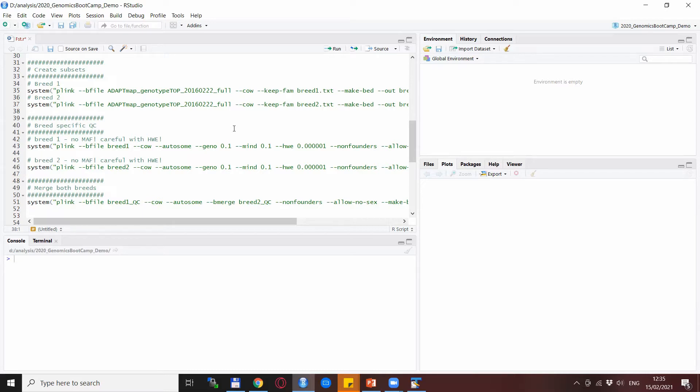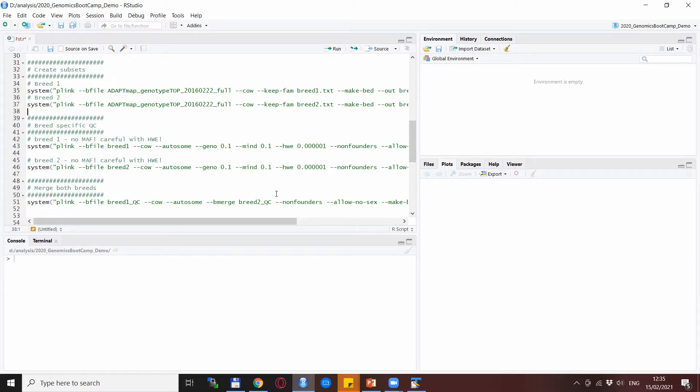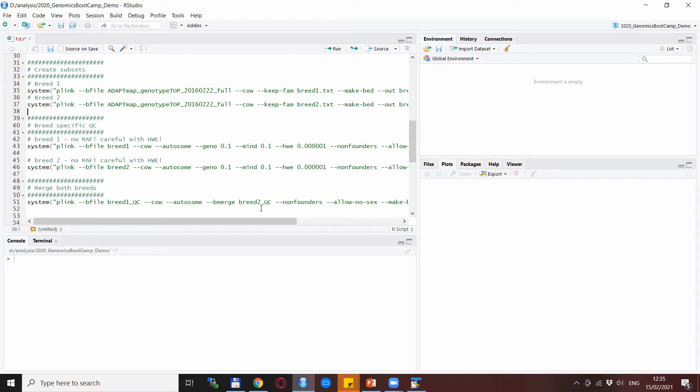For now, we do a fairly standard quality control for breed one. We take the autosomes and delete anything—any animal that is more than 10 percent missing, so the missingness per SNP is more than 10 percent and also the missingness per animal is more than 10 percent. We are also deleting SNPs that within breed do not adhere to Hardy-Weinberg equilibrium rules, and at the end we create breed one QC and breed two QC output files.